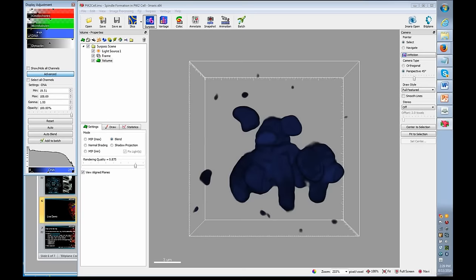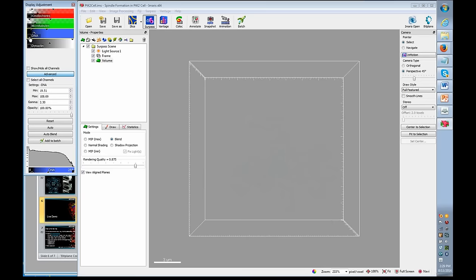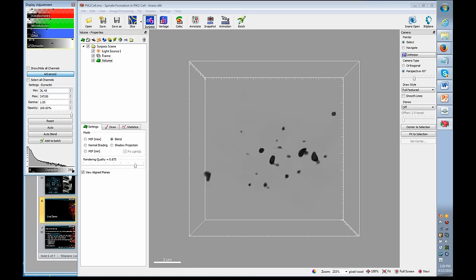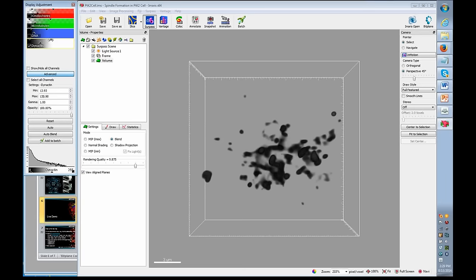So if you just want a quick and easy rendering, it's not always the best choice, especially if you have a lot of channels to adjust. But it does give you some more information, so I personally prefer it if I'm using it as a visual reference to guide some object segmentation, get an idea of how accurate the segmentation is and so on.